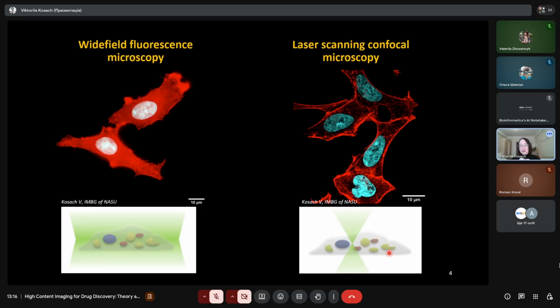There is a bit other approach. I think maybe you heard that there are confocal microscopes that are called spinning disk microscopes. These microscopes have the same aperture with pinhole, but actually a lot of pinholes on the disk that is moving and collecting this light from the whole area much faster.